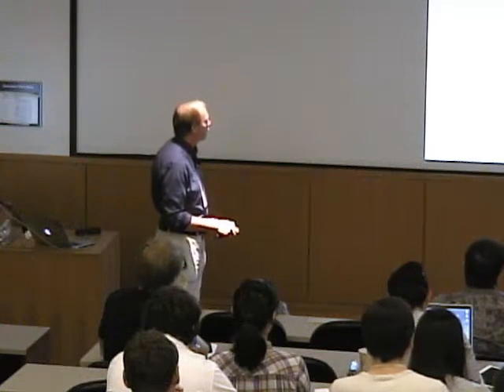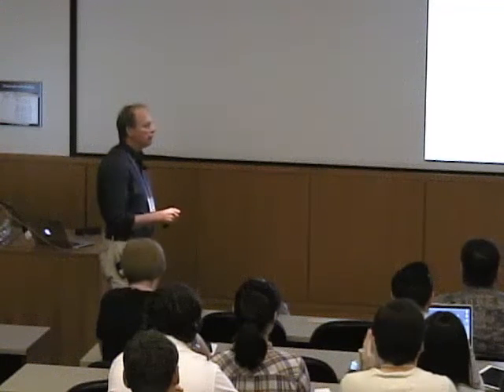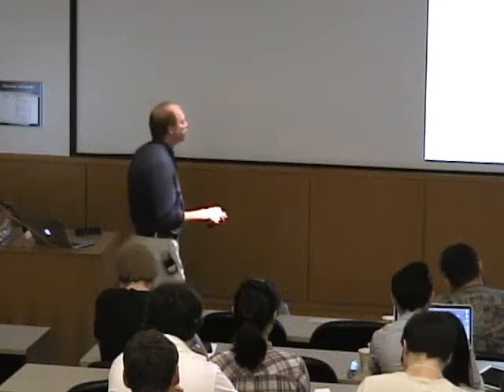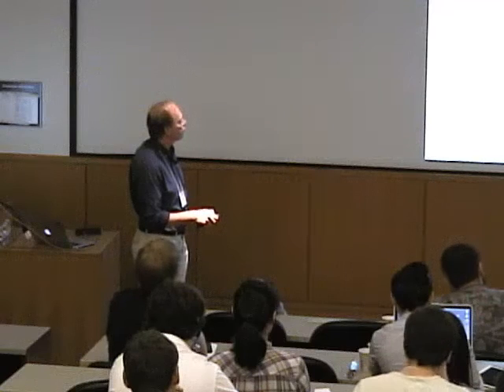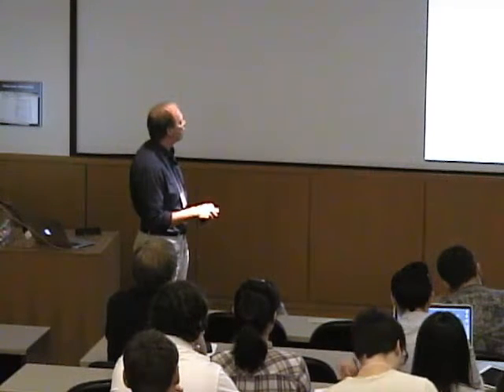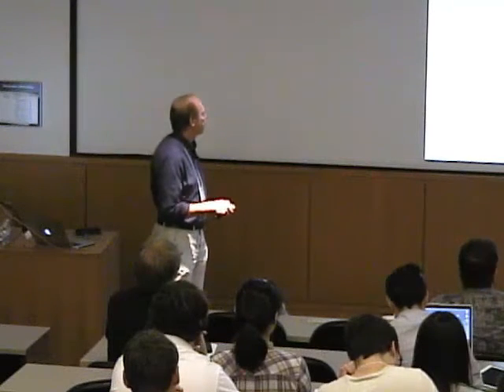You can see down here there's a small correction to it, which comes from relativistic effects, but basically the number is 2 here. This is the Bohr magneton, which comes out of the Bohr model of the atom, just working out what the magnetic moment for a circulating electron should be. And then we have the spin quantum number here, right? And this is basically the length of the spin vector here. And so for an unpaired electron, we can work out very easily what the magnetic moment is.